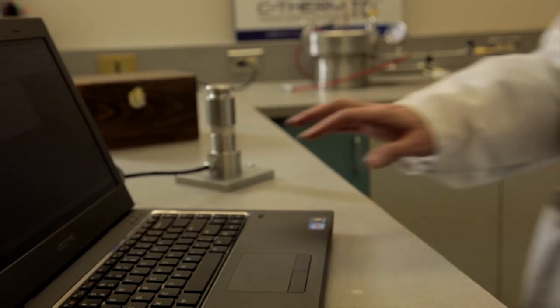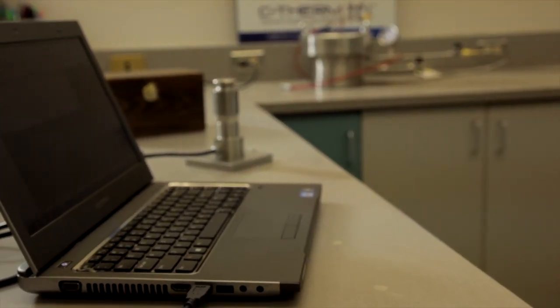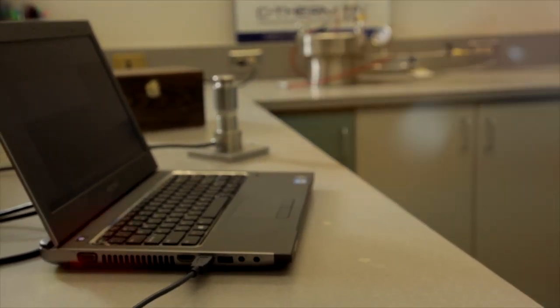While with the simple push of a button, the TCI provides highly accurate results in seconds.